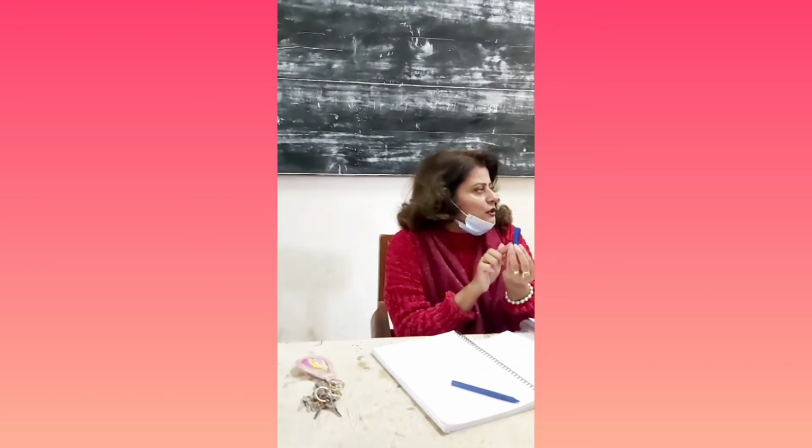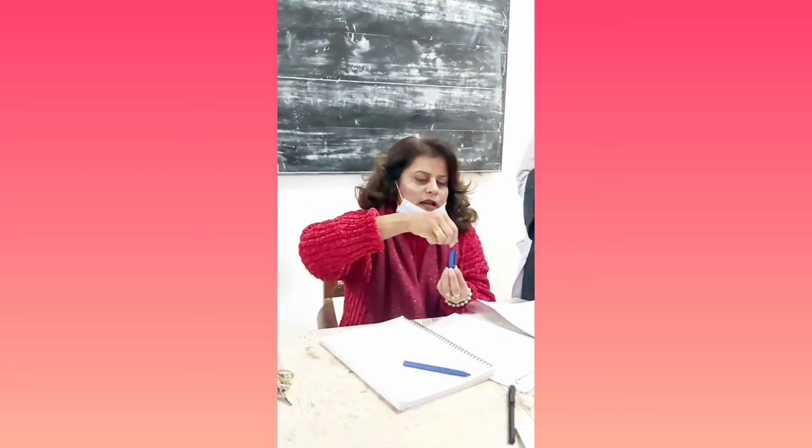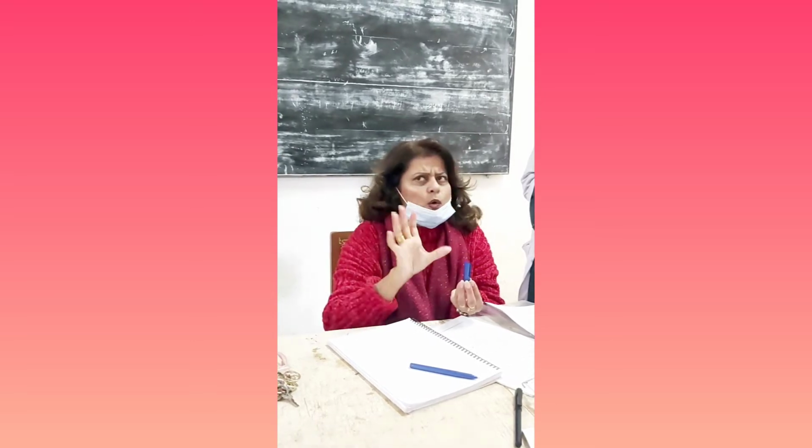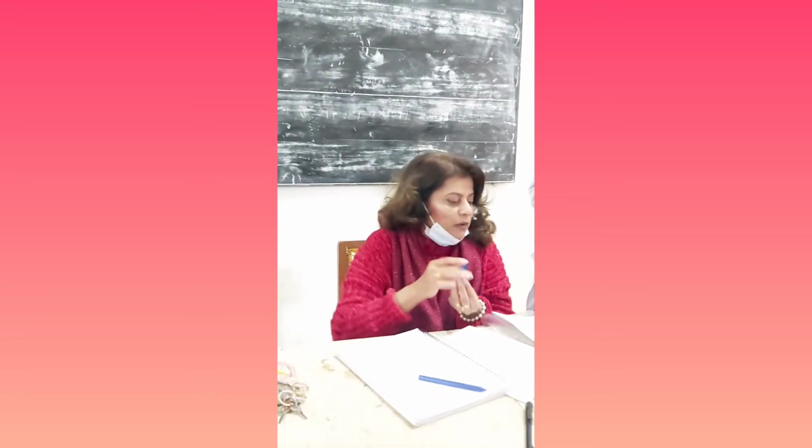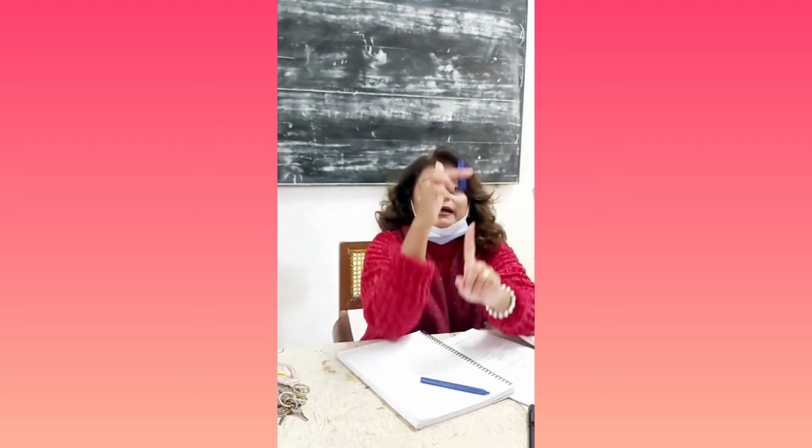And now what happens? The substance. What do you mean by substance? Your organic compound. Your benzoic acid, our organic compound. So it's gonna react with it, because the sodium is not alone. It's with your organic compound. So it's gonna react with it, right? This is gonna happen. Now we are going to do a strong heating. They said that add a little bit. You can take a few more granules and put over it, because it's a qualitative analysis, as I mentioned again. You do not need to measure. And then now you will do the strong heating.